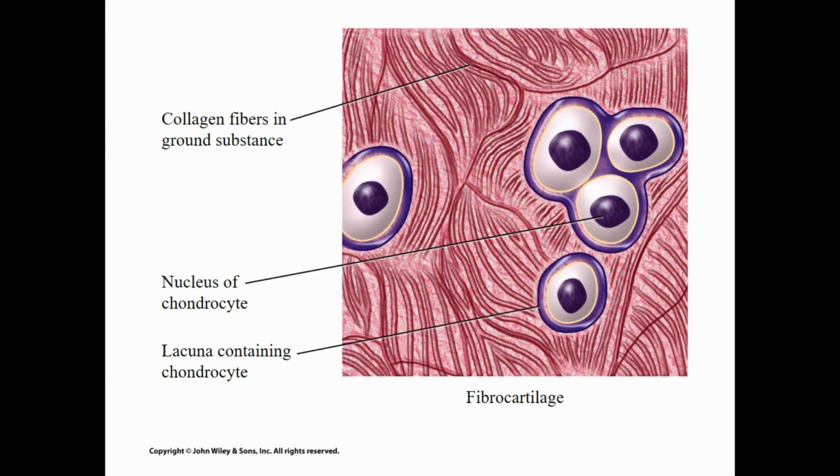And here is the artistic version. So we can see these densely packed collagen fibers running through the extracellular matrix.